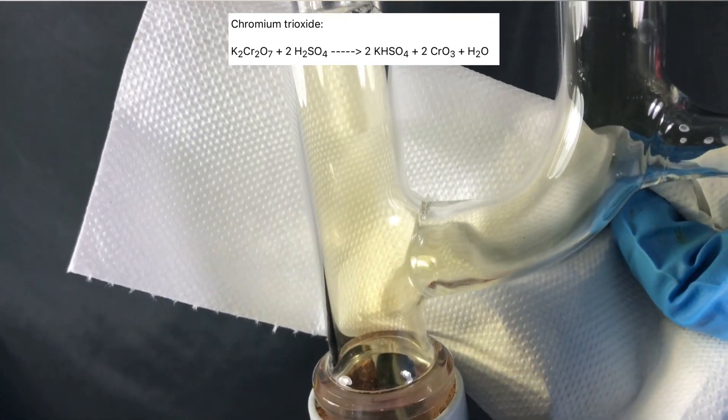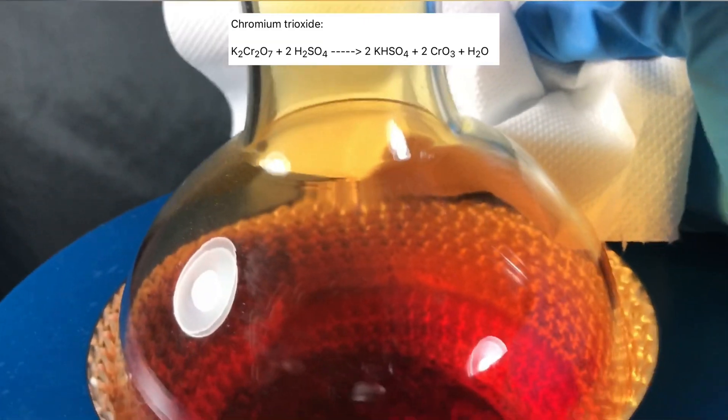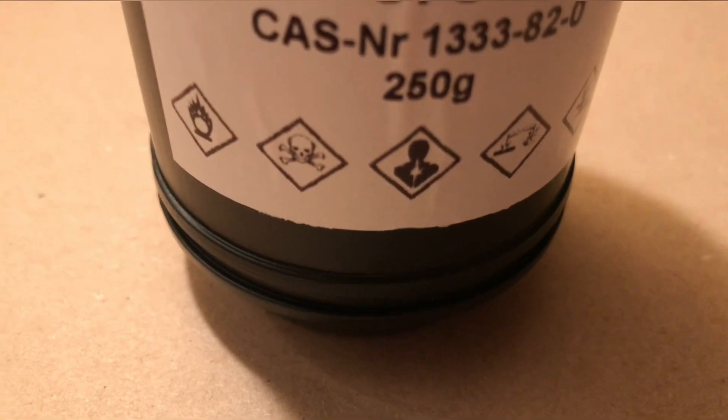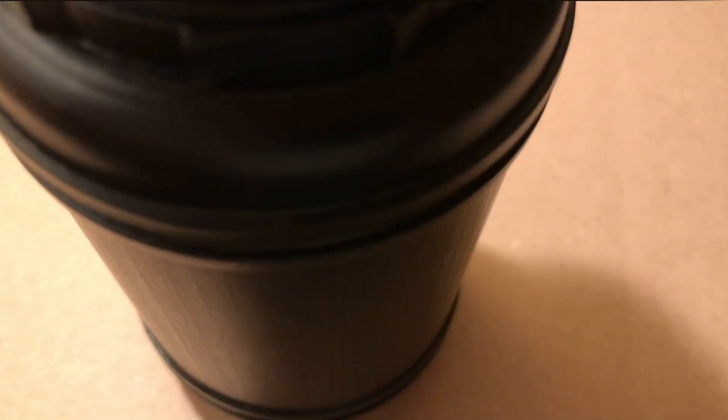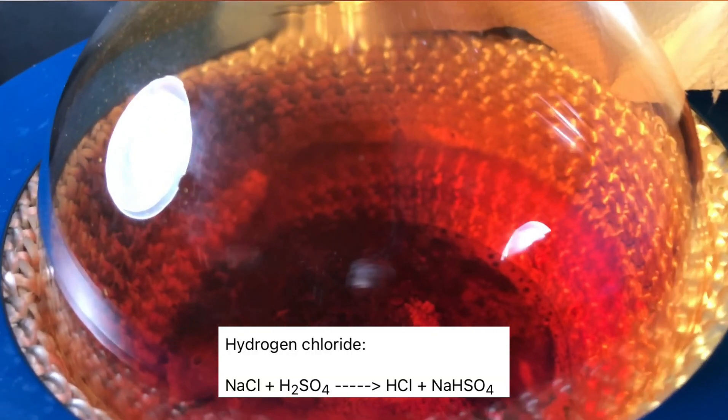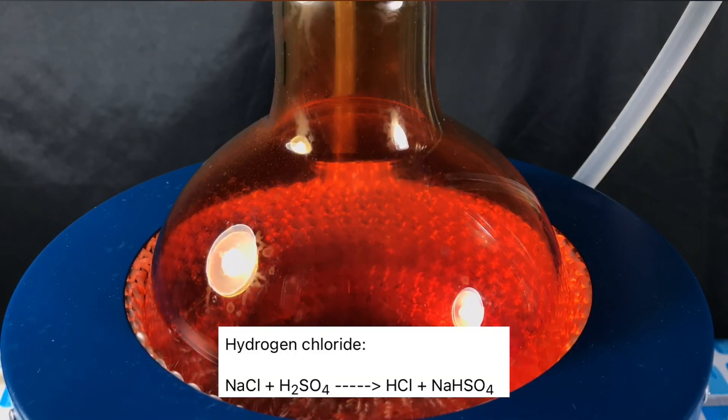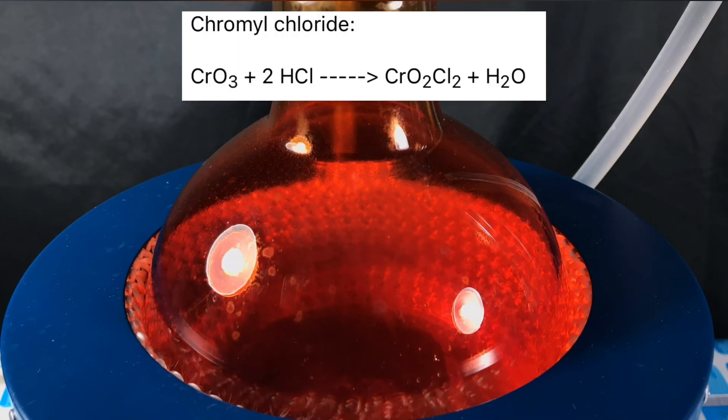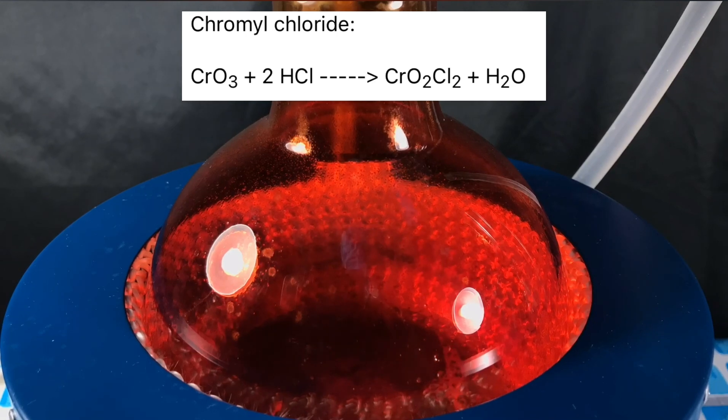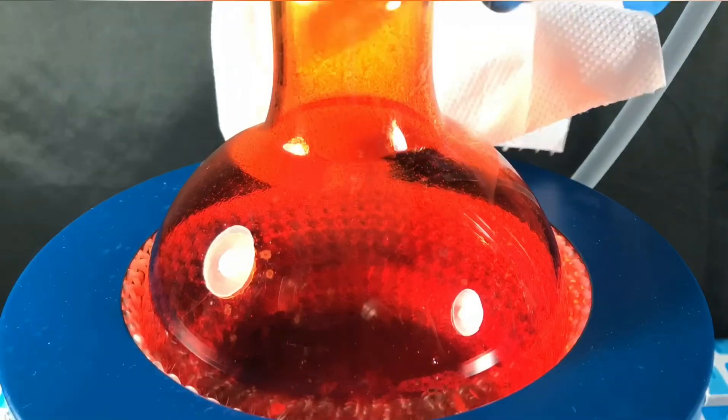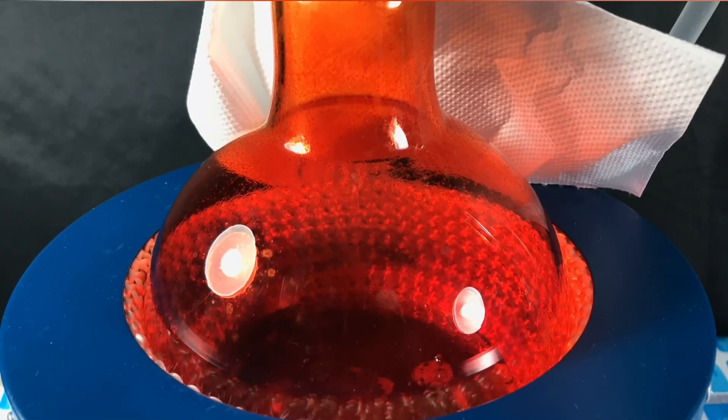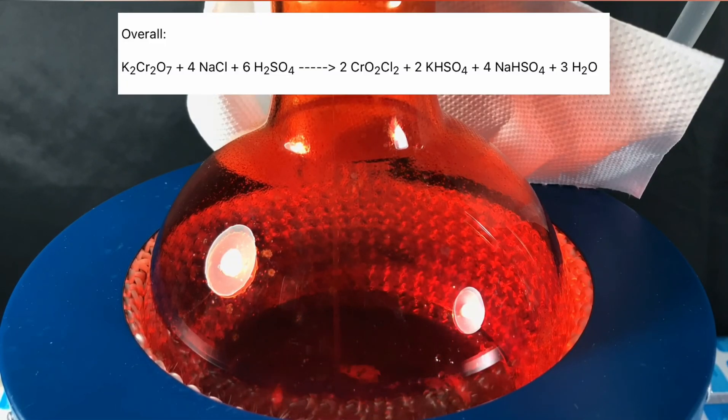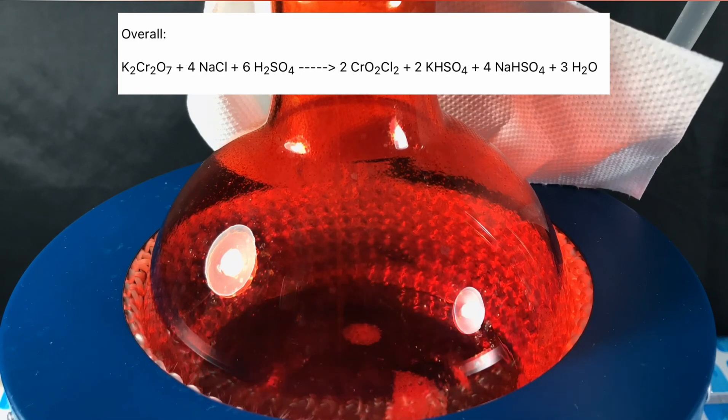At first the potassium dichromate reacts with sulfuric acid to form potassium bisulfate, chromium trioxide and water. You are probably interested in what pure chromium trioxide looks like. Well, I have it, so let me show it to you. Pure chromium trioxide is red solid. At the same time hydrogen chloride is produced. The chromium trioxide and hydrogen chloride then react to form chromyl chloride and water. Because chromyl chloride is quickly hydrolyzed by water, a large excess of sulfuric acid was used to prevent that. All reactions taking place can be summed up to what you see above.